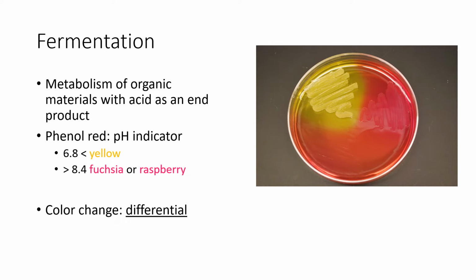So if I see acids, that will tell me that the mannitol has been fermented. Fermentation produces acids. What about this color just to the right in the top right quadrant? Okay, so if you remember your math, this is quadrant 1, and the yellow would actually be in quadrant 2, wouldn't it? Okay, so quadrant 1 is really pink, like really pink. It's a deep pink.